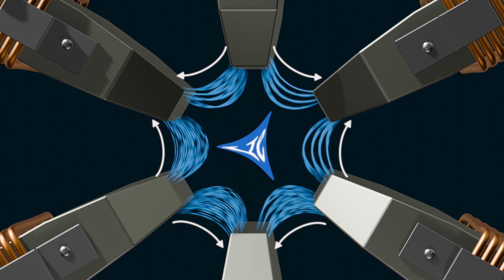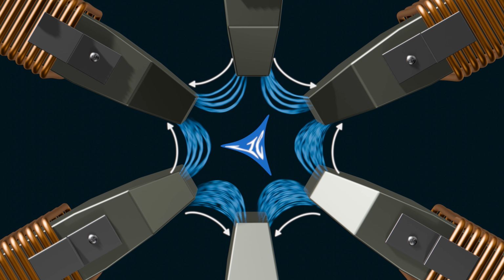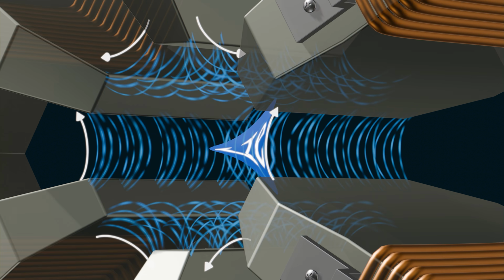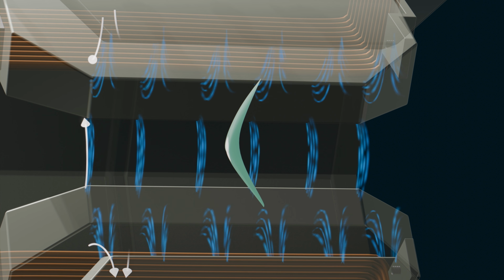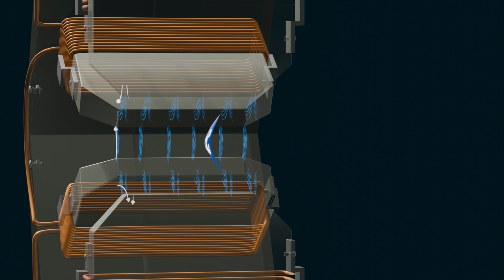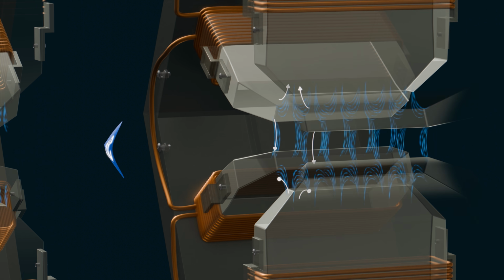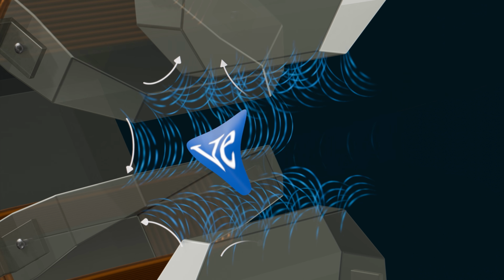And the circumference of the original beam would be pushed into the 3 corners, with the rest of the interior stretched out. But now the middle of the image would have a slight concave bow, giving the effect of a small divergence. Then Rose, Hayter, and Urban forced the beam through a second hexapole, one that worked the opposite way, so it would unbend the distorted image back into a circular shape.